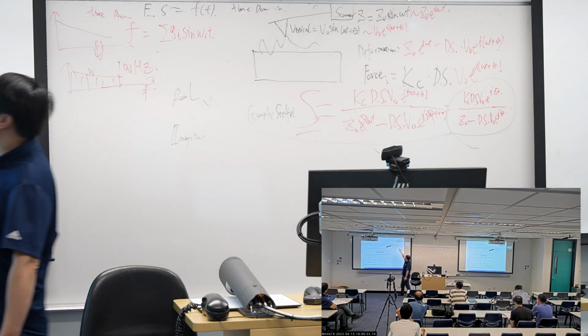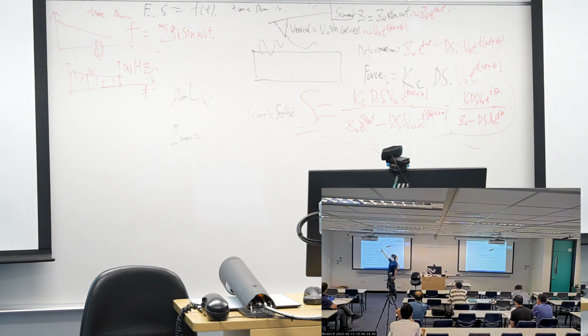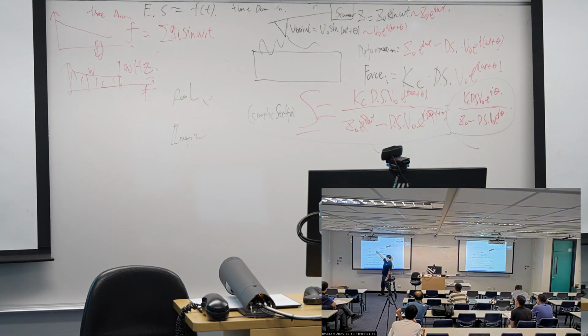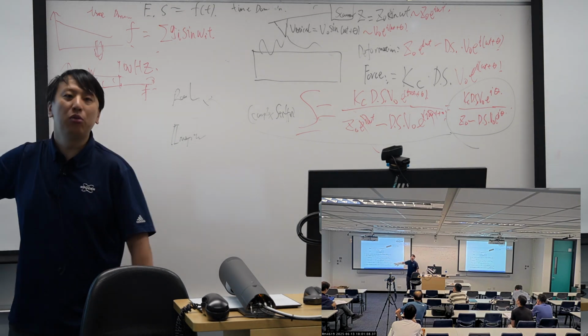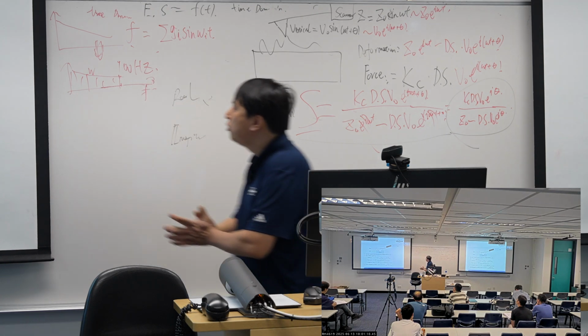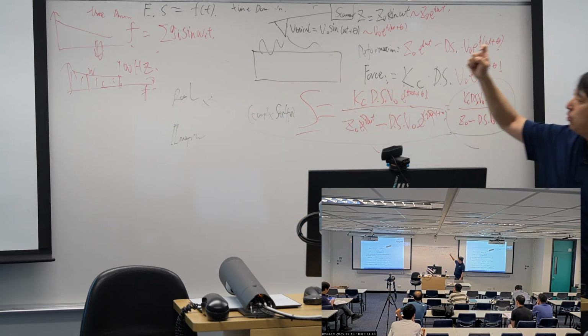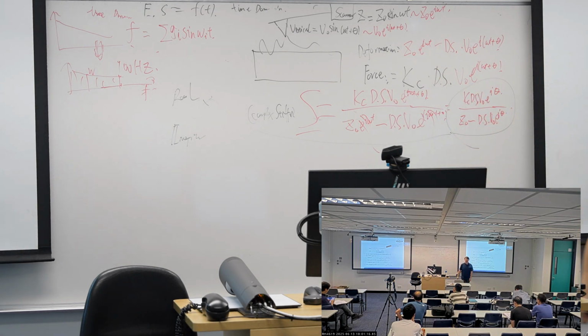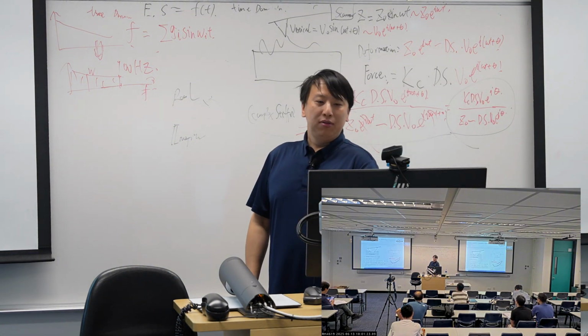What you have to do is set up the Z movement, and the AFM will measure the vertical part, and the software will give you your results. And of course, we need to calibrate Kc. We need to calibrate the deflection sensitivity, absolutely. And then the next step is relatively easy.